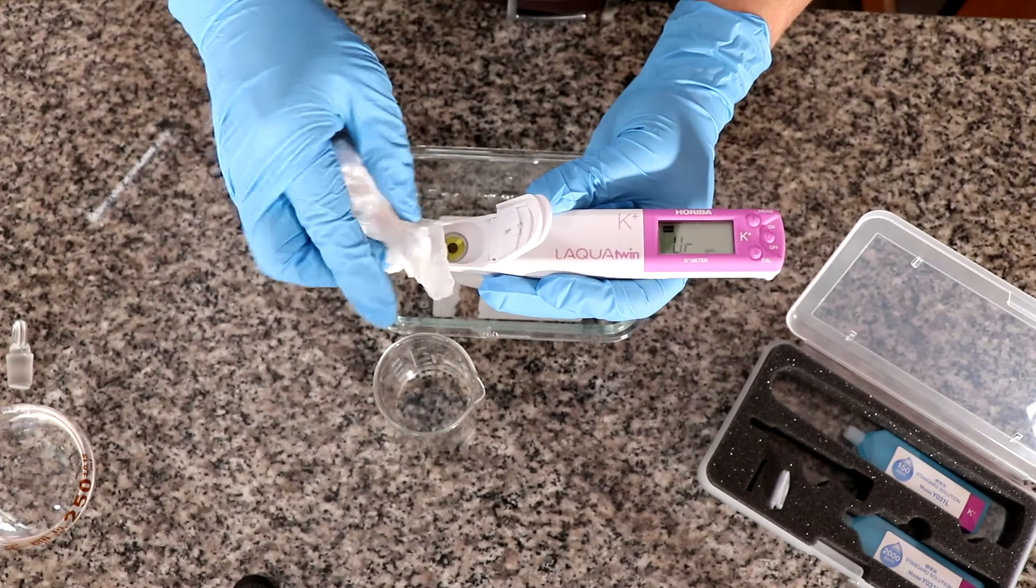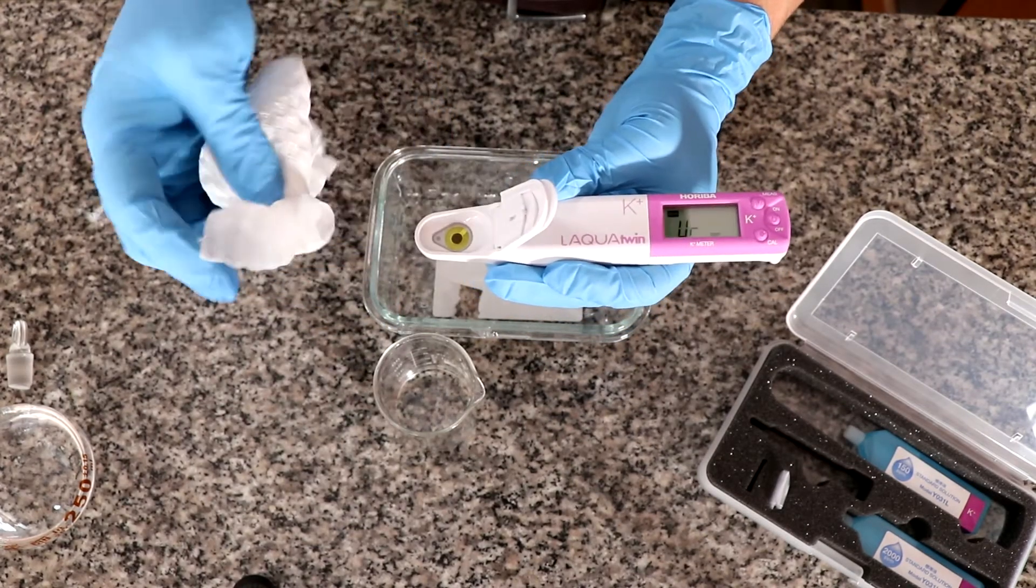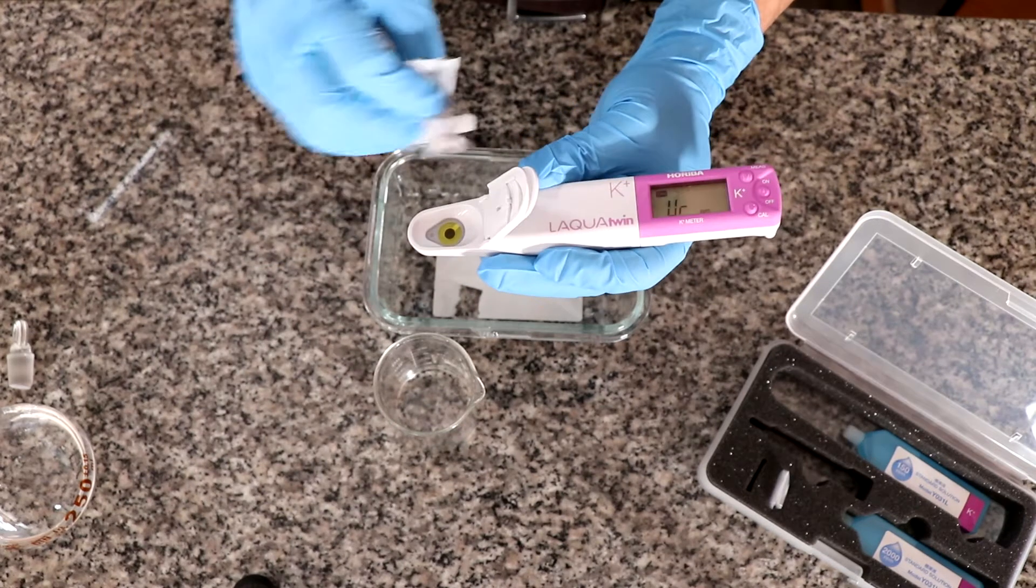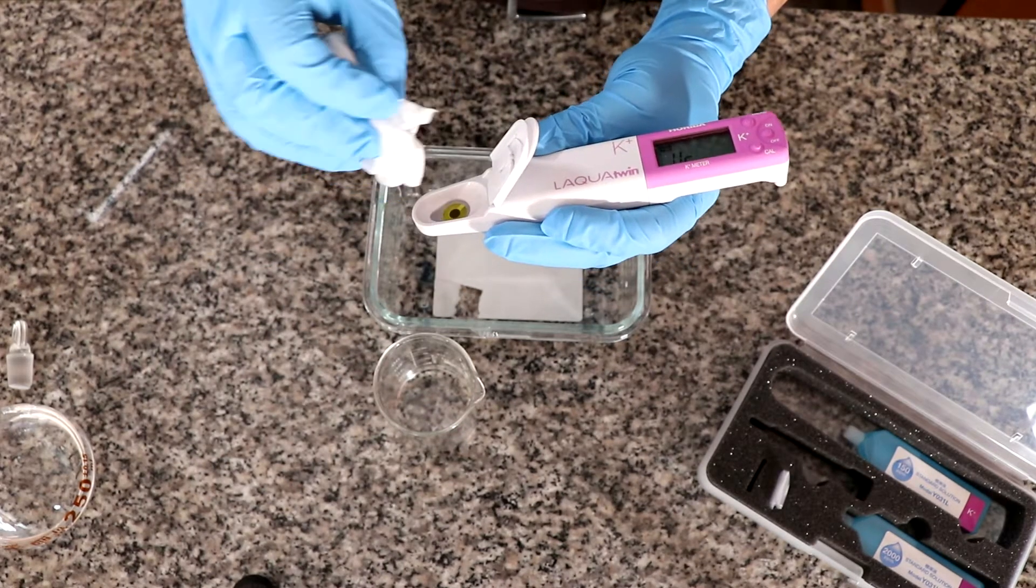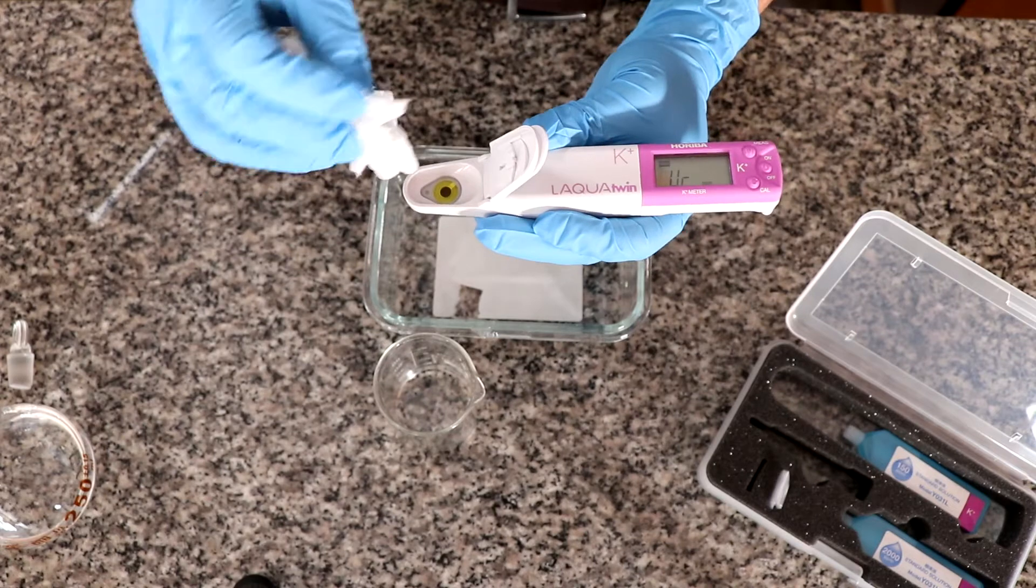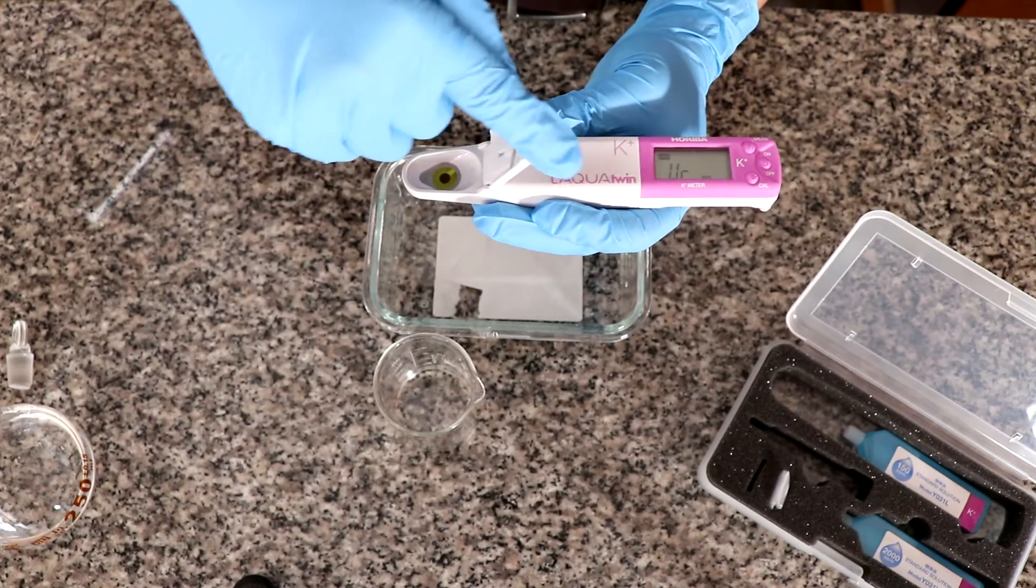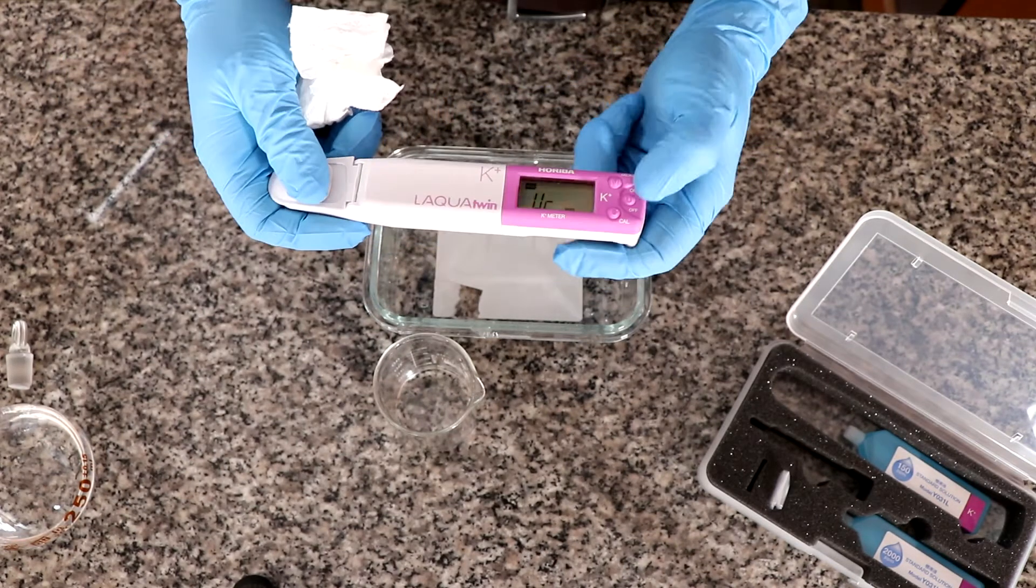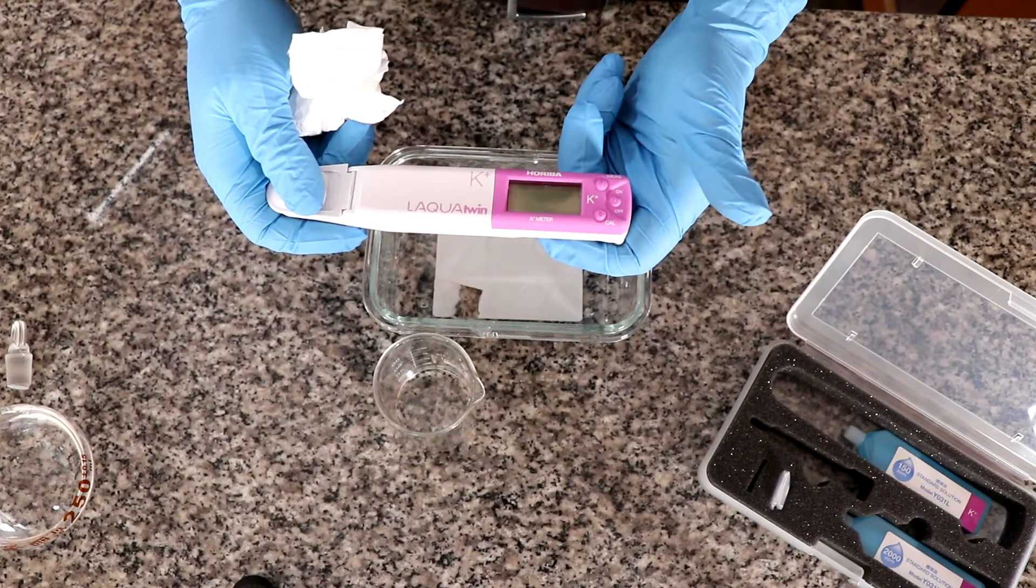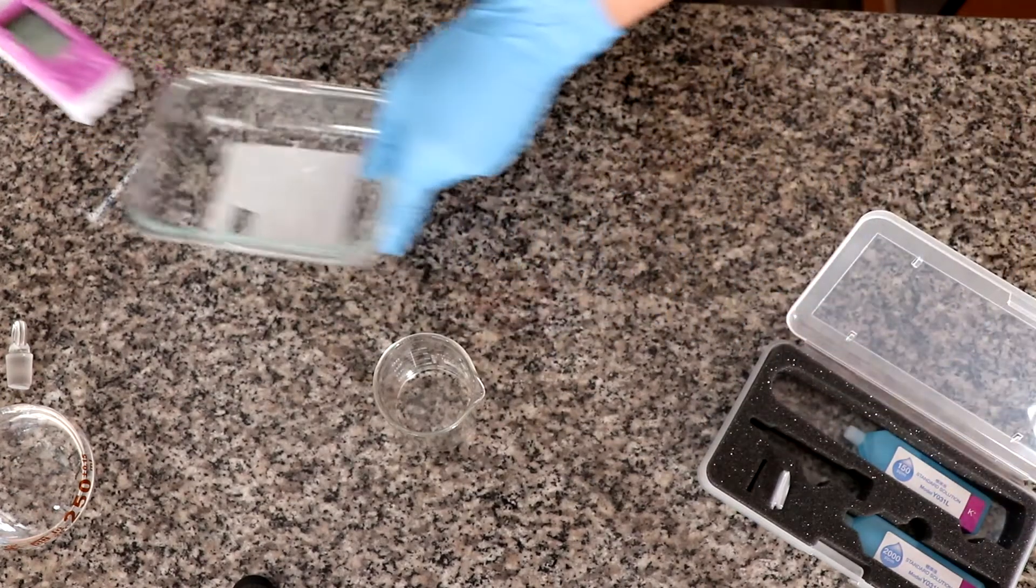So after finishing with your ion selective electrode measurement, you need to do the same thing. Wash with distilled water. These electrodes are supposed to be stored dry. So you want to tap this very gently. Close it. And then to turn it off, you just press the on off button. And that's it.